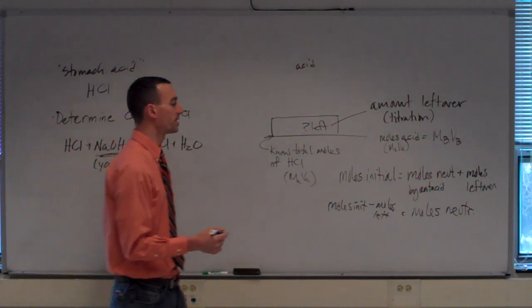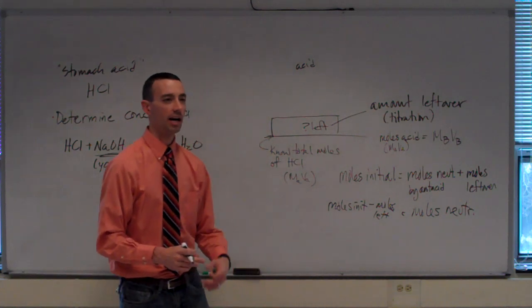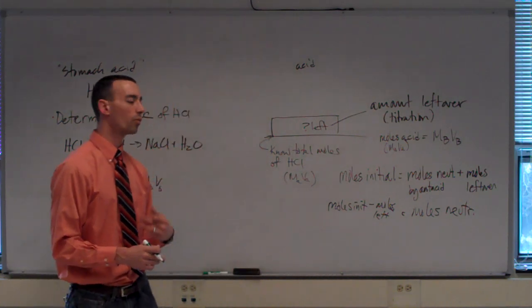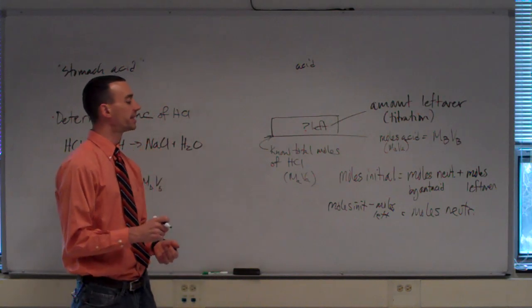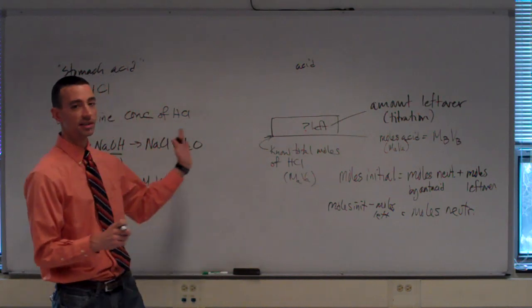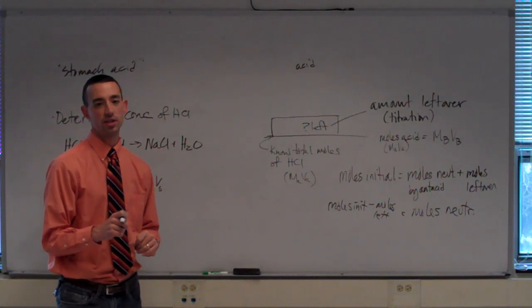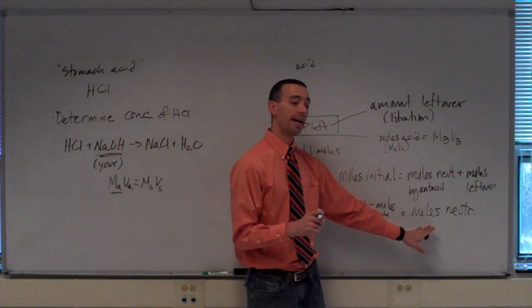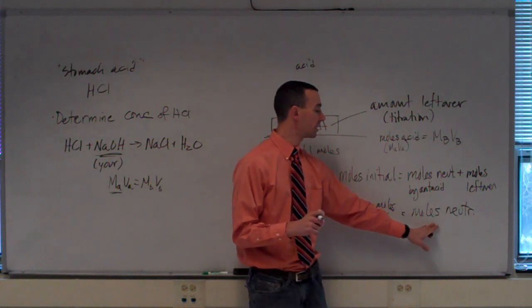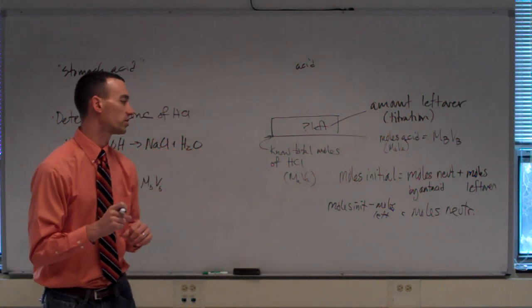In this case, I believe you're only going to use 1 tablet or 1 teaspoon, so that's not going to be a full dose. And you would then begin the same series of calculations that we were doing in the pre-lab questions. You'll just be arriving at the moles neutralized by an experimental calculation as opposed to theoretically from the package values.